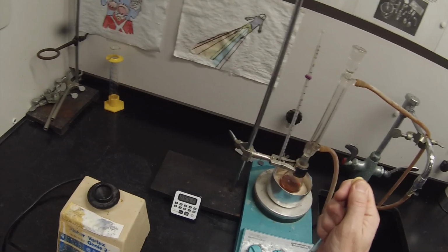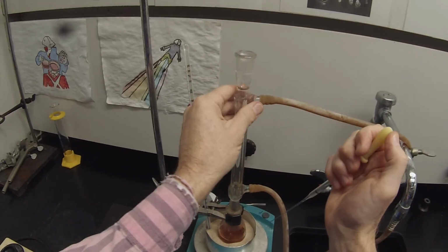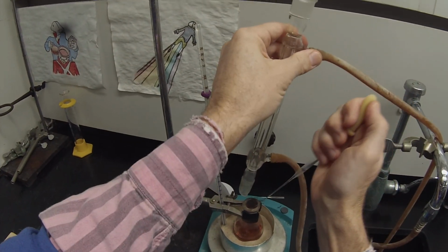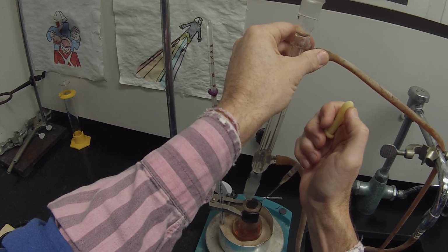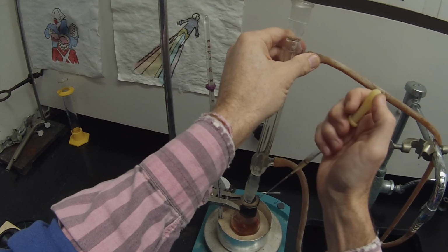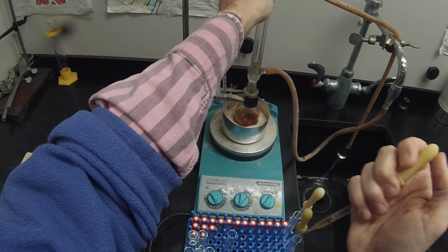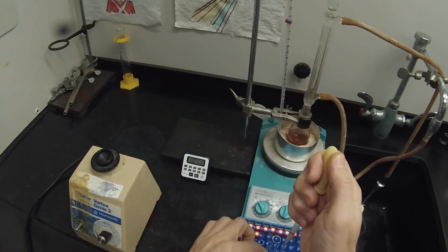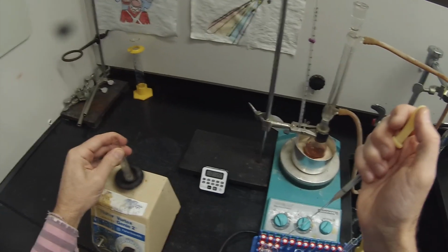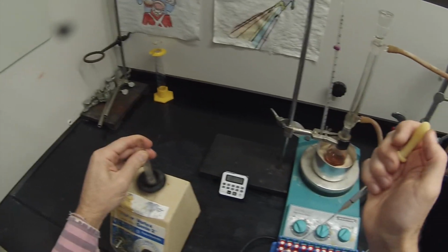Another 10 seconds to go. Just lift that out of there and grab a half milliliter or so aliquot. Doesn't have to be exactly half a milliliter each time. Vortex that. Rinse this.